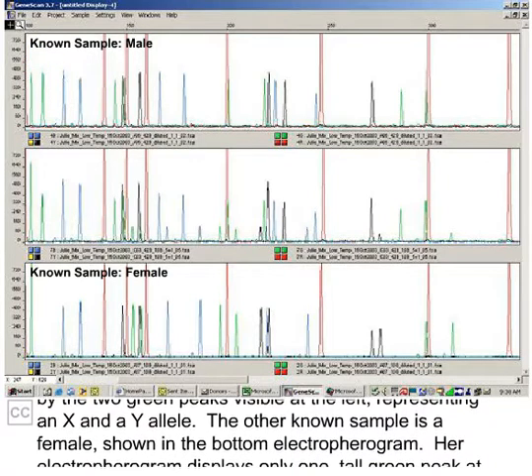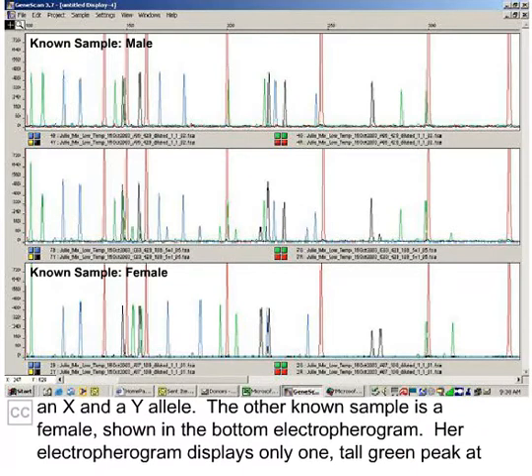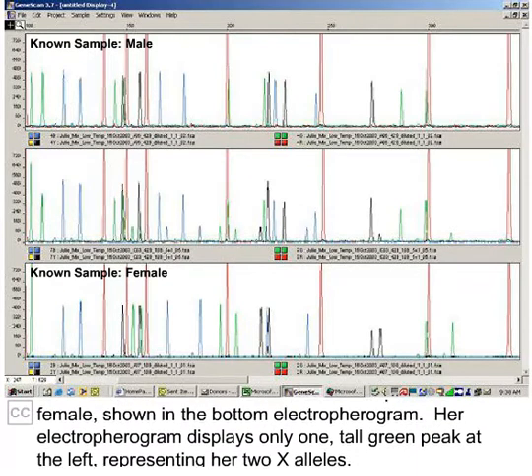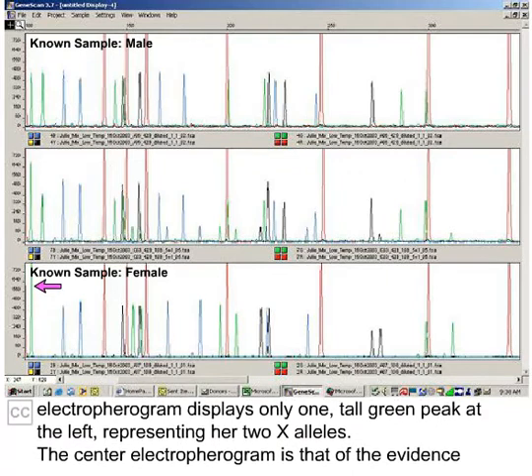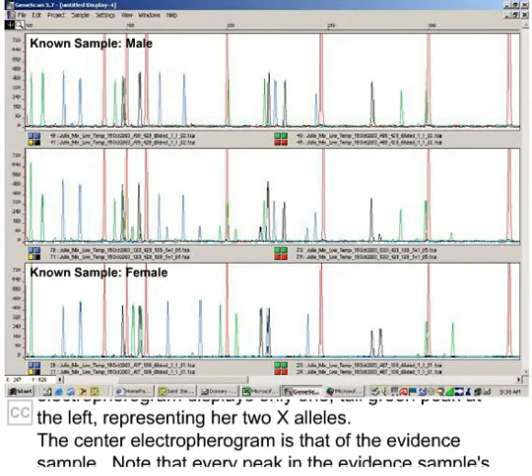The other known sample is a female, shown in the bottom electropherogram. Her electropherogram displays only one tall green peak at the left, representing her two X alleles.